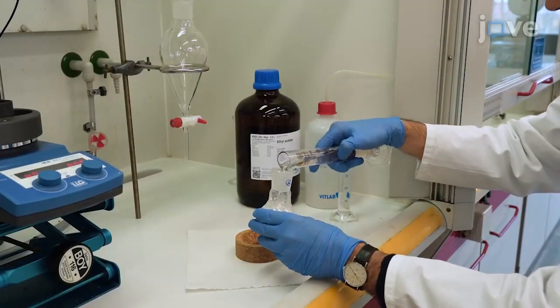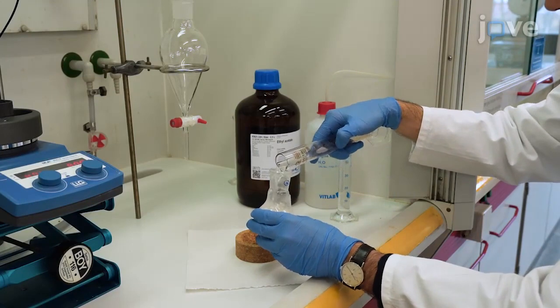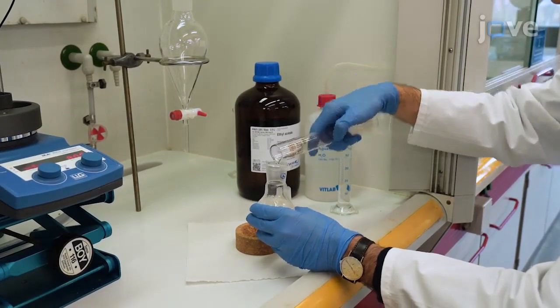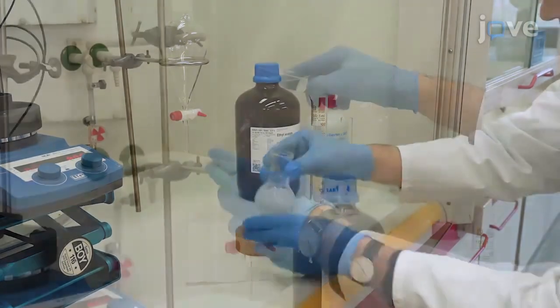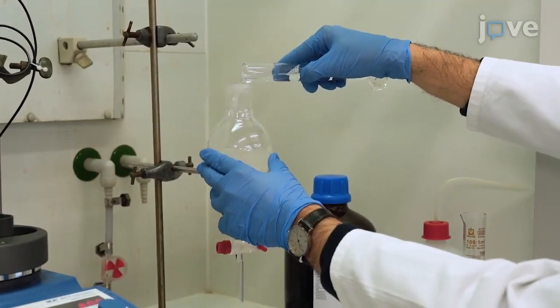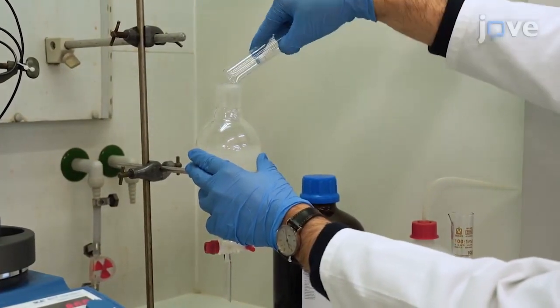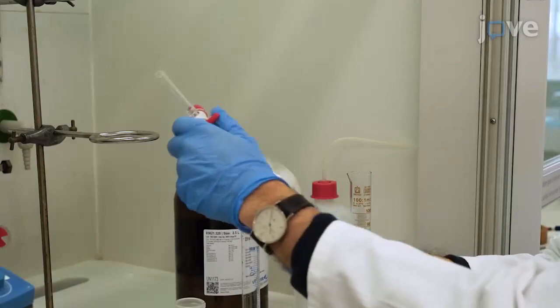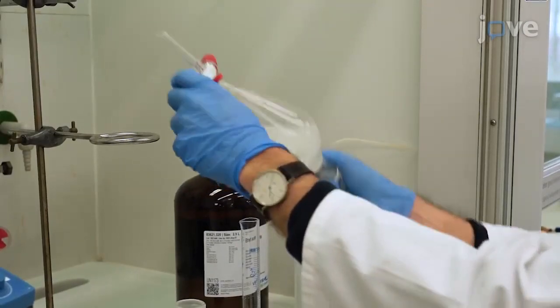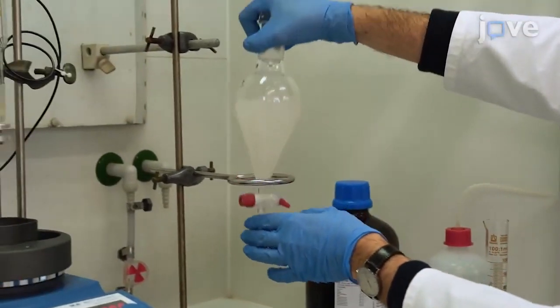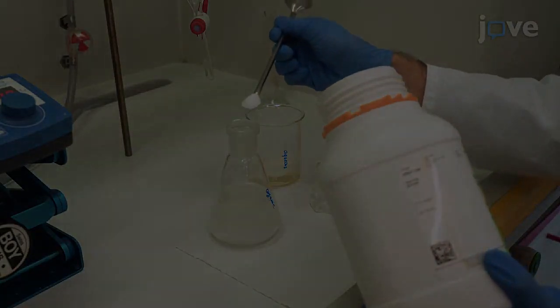Redissolve the residue in 200 milliliters of ethyl acetate and pour it into a separatory funnel. Wash the organic layer with 50 milliliters each of deionized water and brine and dry the organic layer over sodium sulfate. Gravity filter the solution.